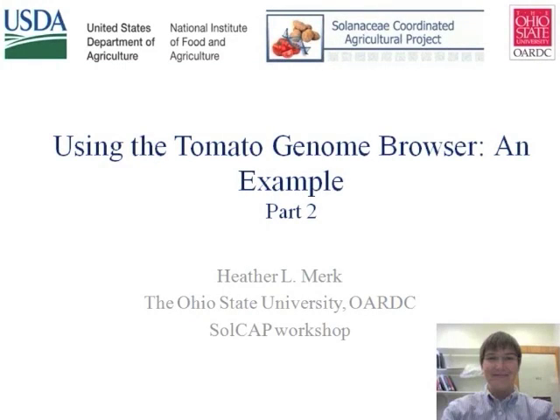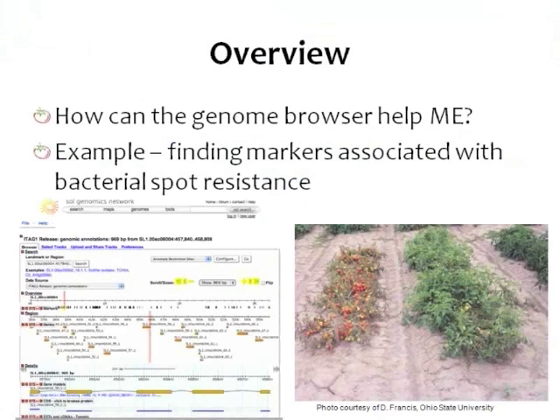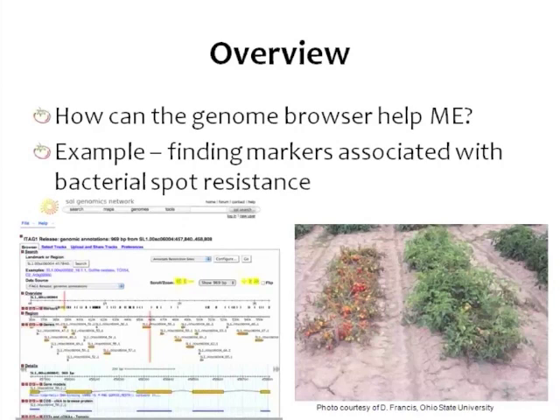I'd like to move on now to the second part of my talk, giving an example of how we may use the Genome Browser. If you're not convinced yet, you get to listen to me for about another 15 minutes. So, how can the Tomato Genome Browser help me? As an example, we're going to look at finding markers associated with bacterial spot resistance.